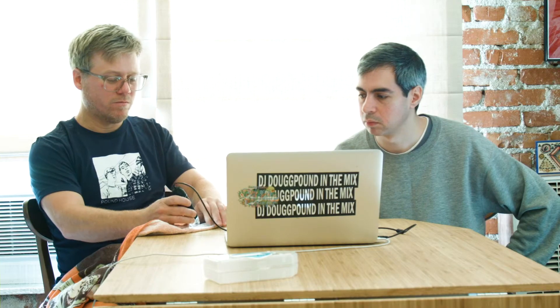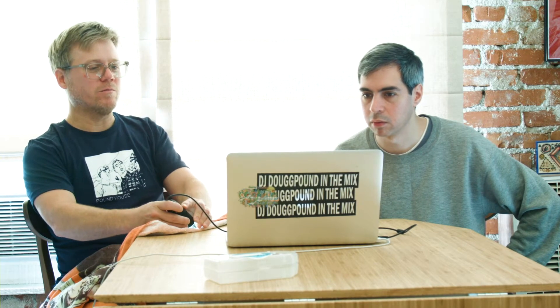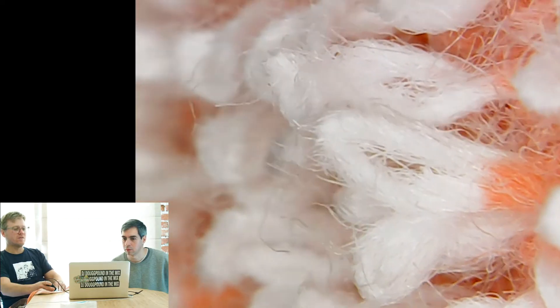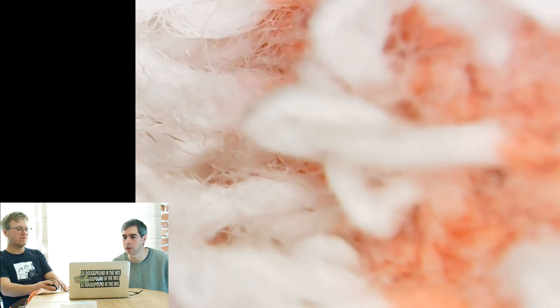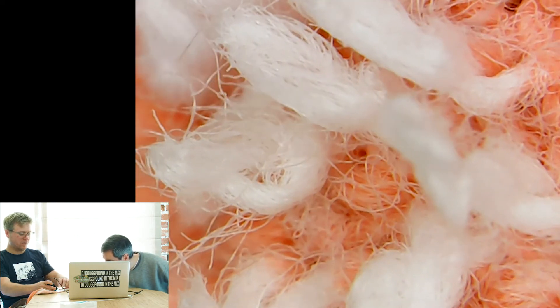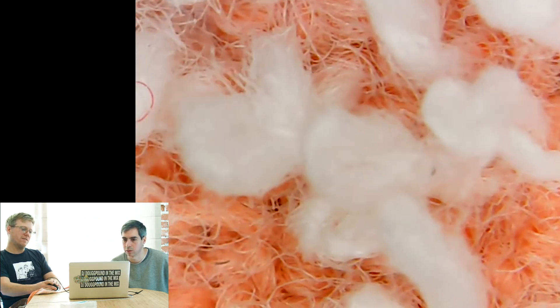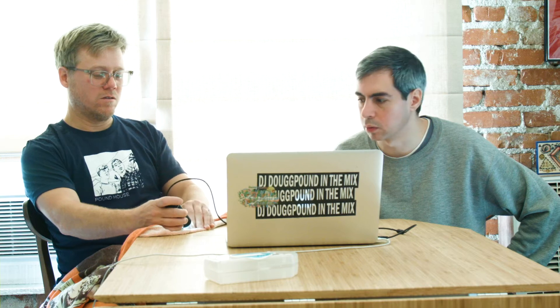This is what I wanted to see — yes, there we go. That is interesting. I'm going to try to get them raised up a little bit. So those are the loops. Those are what dry you off. They're loops. I didn't know that they were loops. You can kind of see that they're loops with the naked eye. I just thought they were little strands. I didn't know they were actual loops.